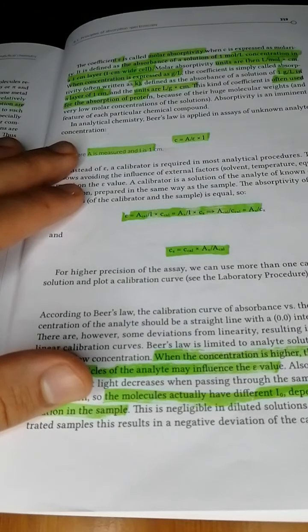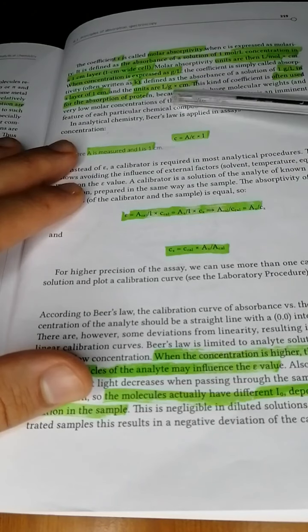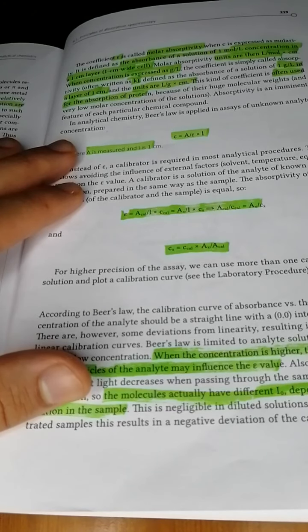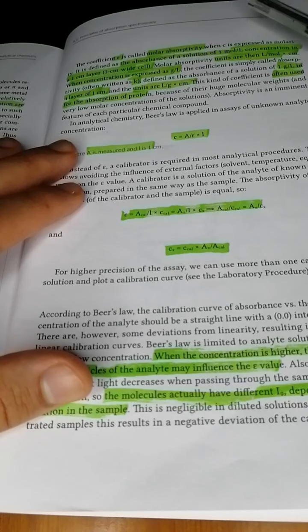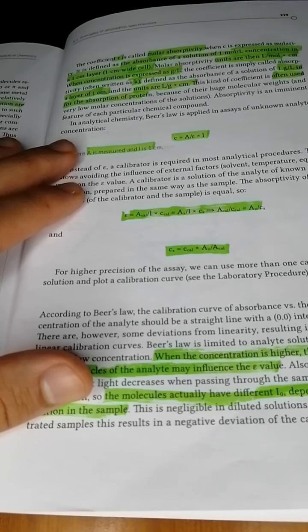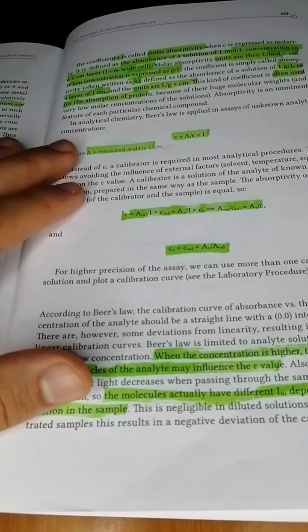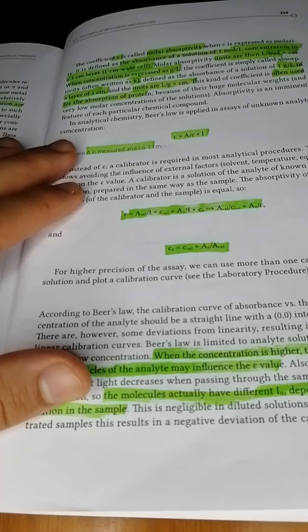Because width here is essentially acting as a measure of volume. Then coefficient absorptivity is essentially the same thing, but instead of 1 mole per liter, it's 1 gram per liter. So when you're measuring concentrations of proteins, you're not going to use mole per liter, you're going to use grams per liter.